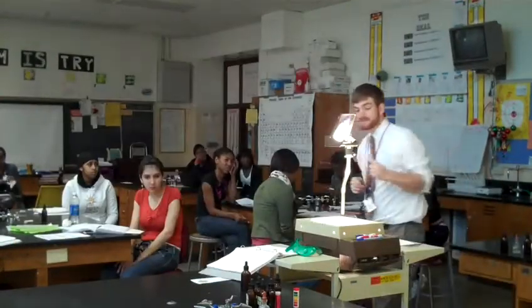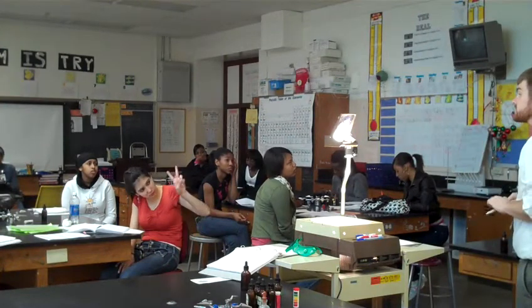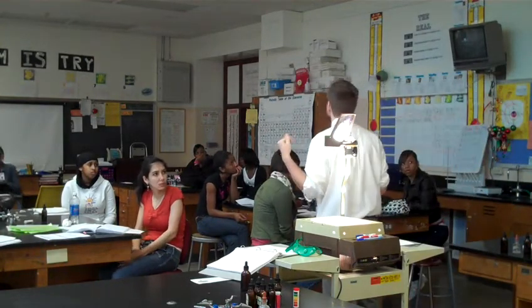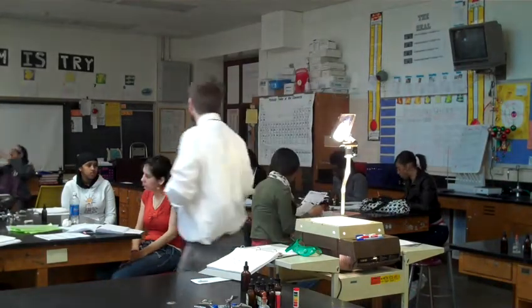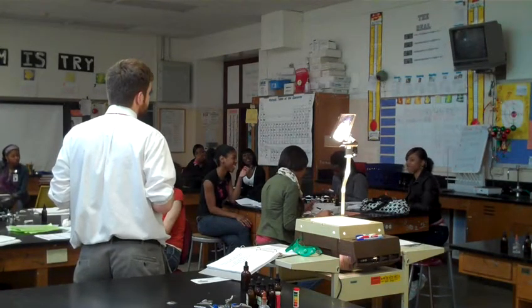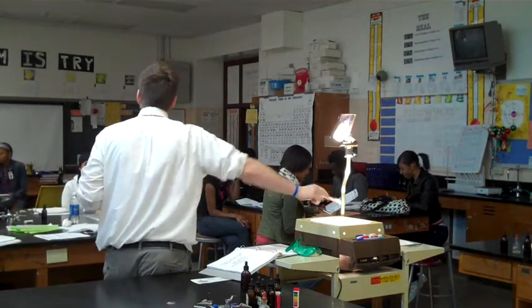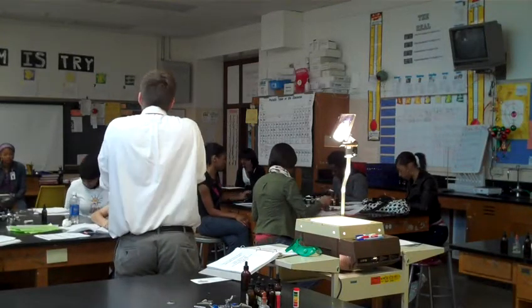Before we get started, how many drops am I going to use of each chemical? Haro, what do you think? Excellent. Before we do anything with the chemicals, we're going to do what? Debbie? Excellent. And when you are done, you will do what? LaSharia? Thank you. After you're done cleaning up, please answer the overall question: is the unknown solution an acid, a base, or a neutral solution? Up for you to decide.